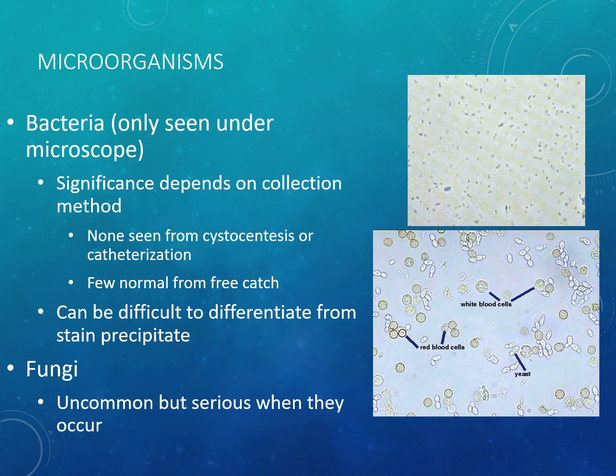As far as looking for bacteria, it is easier to look for them with unstained urine than it is with a stain. A few bacteria are normal in a free catch sample, but if this urine is left out, they may multiply. So remember, if you have a sample and you leave it out for a while and there's an excess of bacteria, it is possible, especially if it was a free catch, that the bacteria have multiplied while sitting out. So here's an example of bacteria.